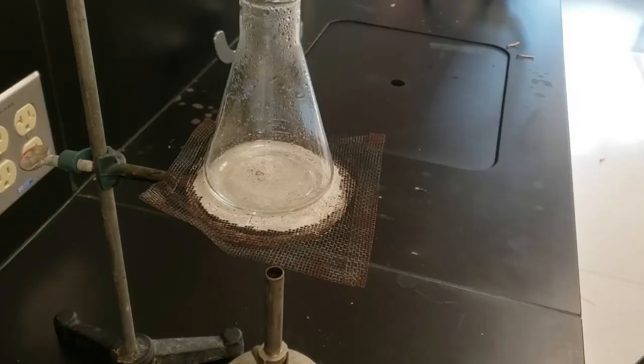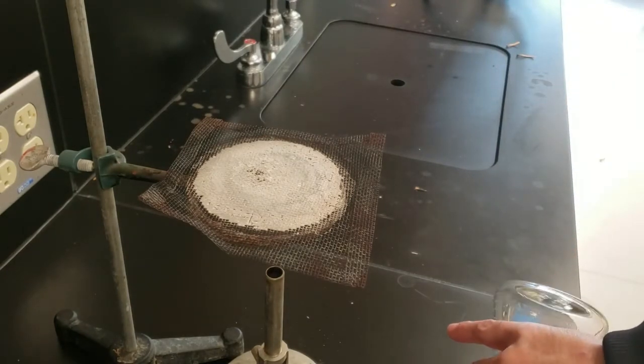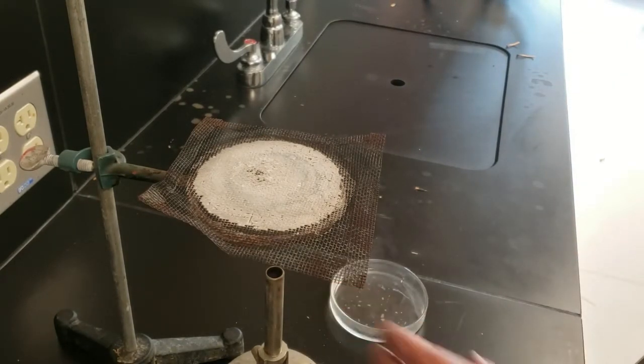A few moments later. But now I'm going to pour this into a Petri dish. So here I go. And there it is in the Petri dish. And so now I'm going to perform a flame test with this and record my results in my data table. So we'll do that in just a second.